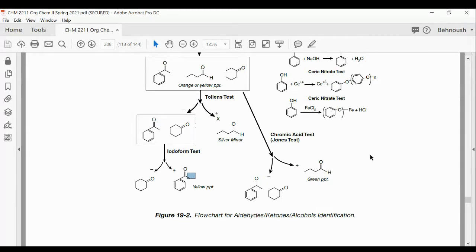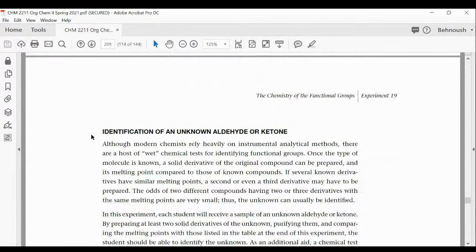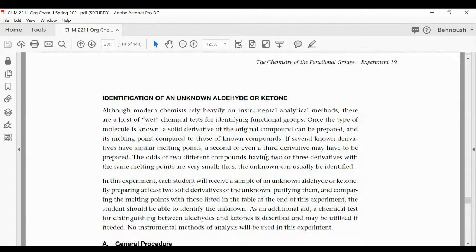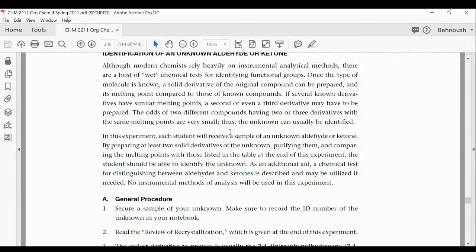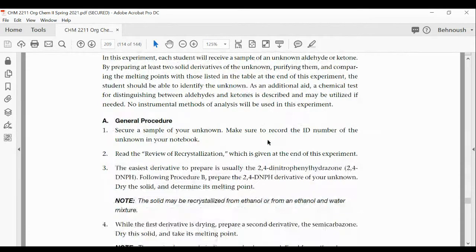So these are some of the classification tests again. You're practicing, you're recording down your observation, how it would look if it's positive or negative, to train your eyes and your thoughts. So this way you can get a step closer to identifying the unknown. We are not performing tests for unknown, but keep in mind you have a procedure here that can help you in 2 weeks from now when you are actually working with the unknown.